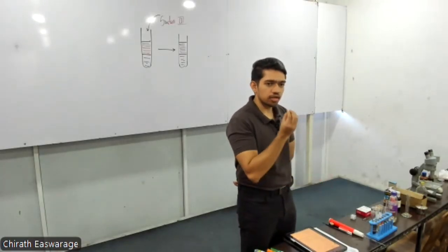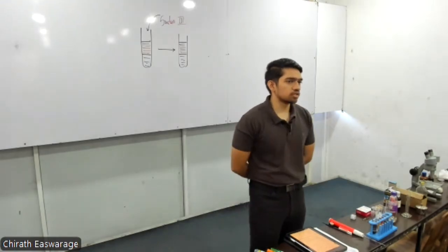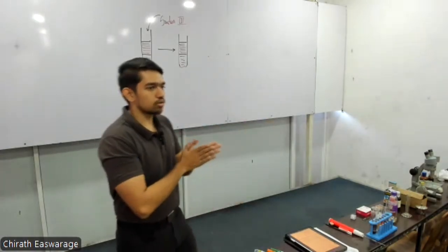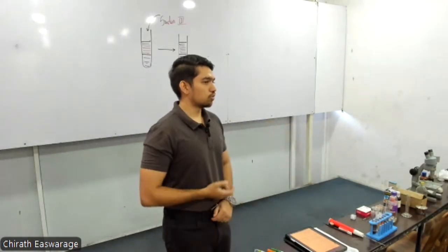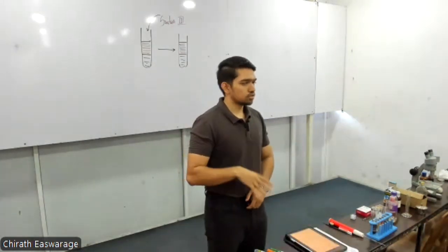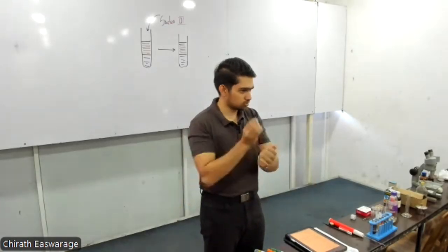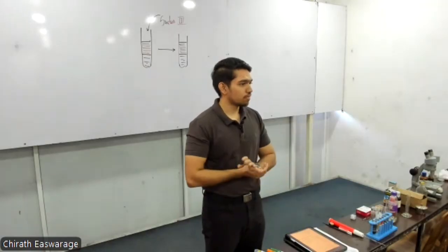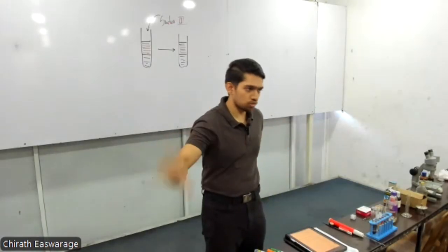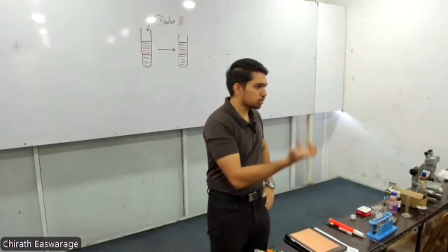No. Our naked eye has a limited capacity to see small things, right? You will see there's a value, resolution power, there are some parameters. Our eye is not able to see these small cellular structures, but the invention of microscopes gave us the doorway to study these small microscopic structures. So before we start studying the cellular structures, we need to know how we are going to study them. That's with the help of microscopes.